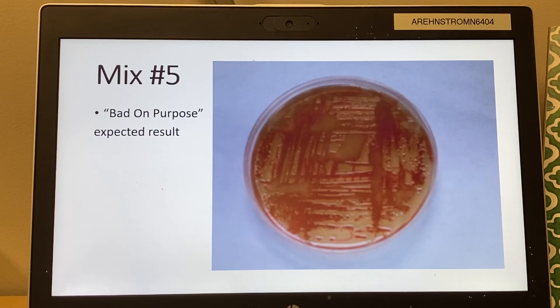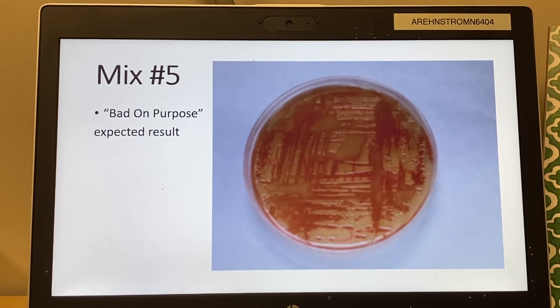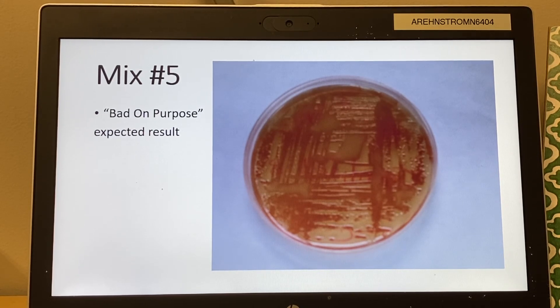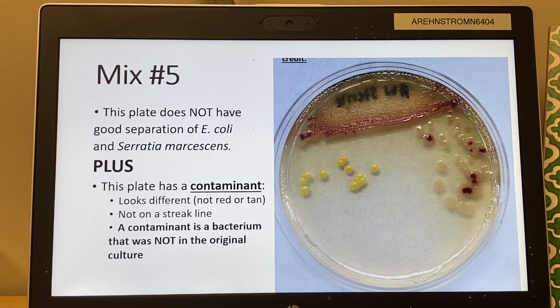I'm also going to have you do a plate that is bad on purpose so you can see the differences. This is the plate where you do the streaks but don't incinerate in between — look at what a huge difference it makes. There's no dilution whatsoever and you can't see any individual colonies or good separation. The key is you have to incinerate the loop in between streaks or you're not going to get the desired result.